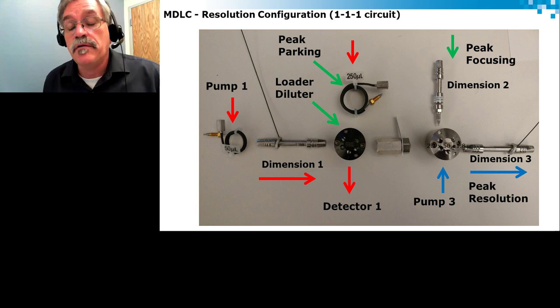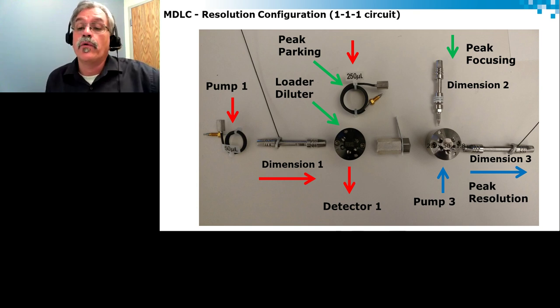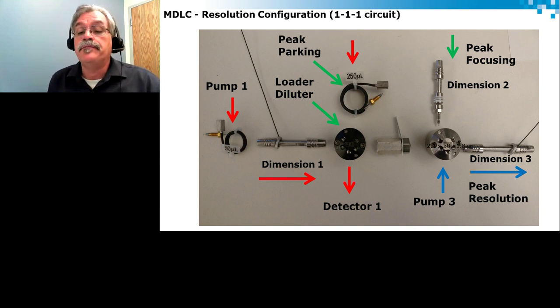Now, those were aspects of how we can use a simple trap and elute type of configuration. There are actually multiple that we can do. Now, if resolution is the scenario to go for, in this case over here, we have what we call a loop trap configuration. So we take a hard cut from my first dimension, and we can park it into, in this case, a loop, and push everything of that loop onto a trap for peak refocusing.